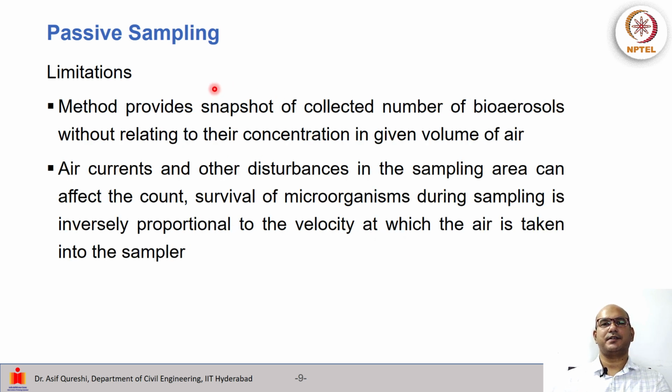Passive sampling limitations are that the method provides a snapshot of collected number of aerosols without relating to their concentration in the given volume of air. So we basically put the plate and do the collection for 1 day or 1 week, and then analyze it after 1 day or 1 week.